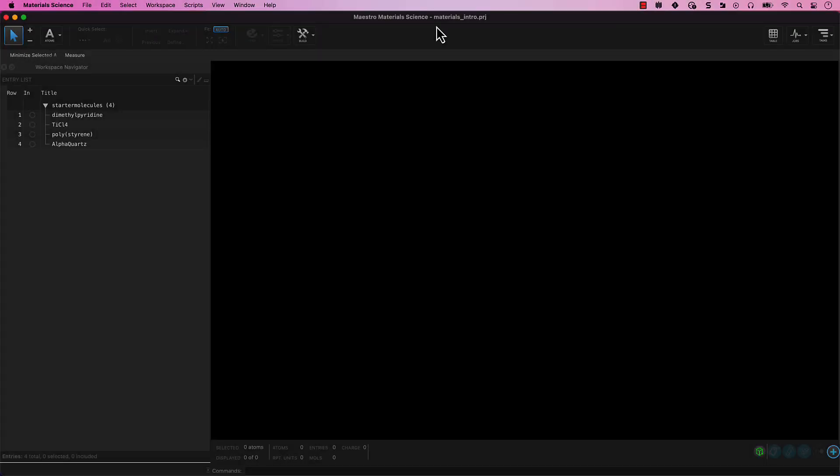Make sure you are back in your materials_intro project and your materials_intro working directory.